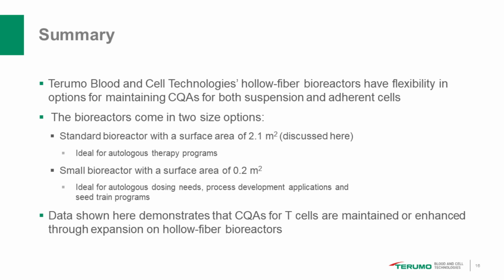And what factors in the bioreactor change when working with adherent cultures? Is there a further explanation on that? As far as density goes, we have recommendations on the density of cells to seed to begin with. When we load cells on the Quantum, we don't have fluid passing through that cell circuit for the first 24 hours. We keep it very still.